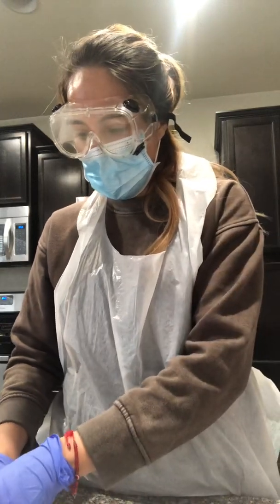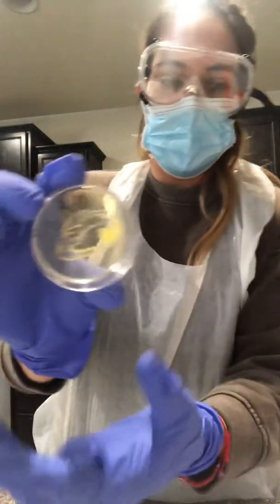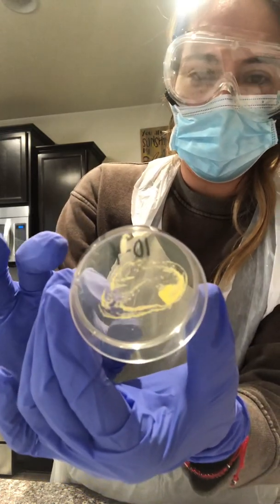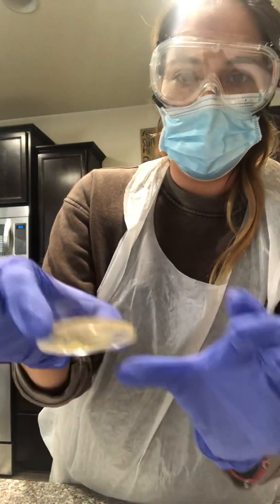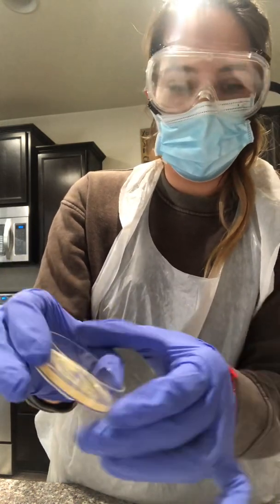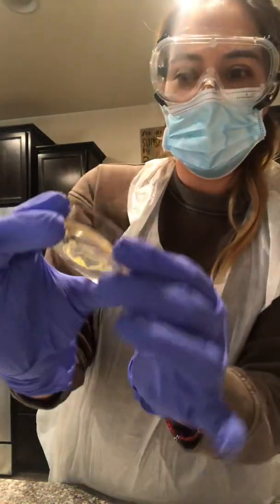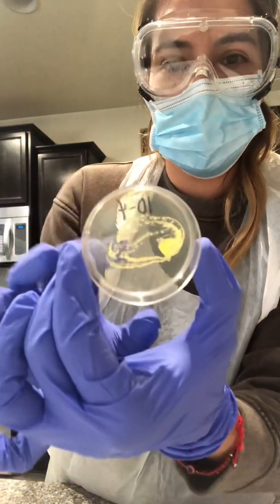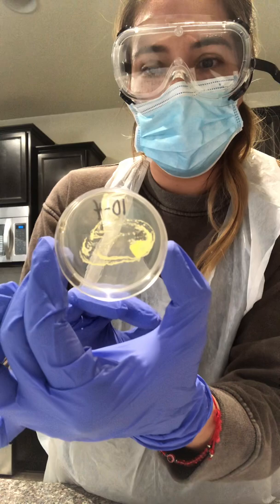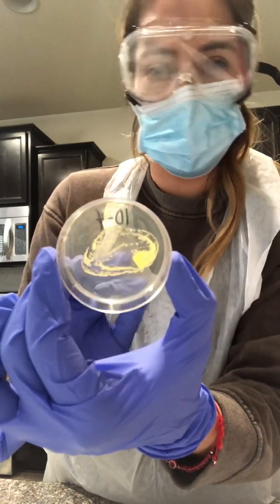And for my 4th one, this one, it grew in the center of the plate. Maybe I should have strolled in more. Maybe I didn't do it enough. And it looks flat, and it looks to me more of a light yellow color with a little bit of gold.